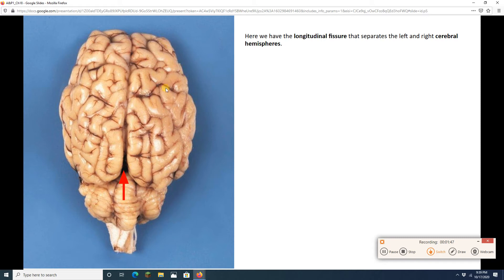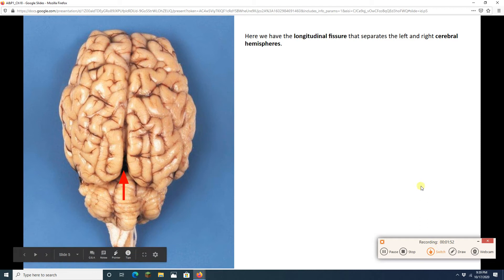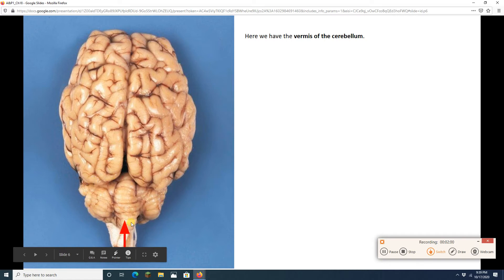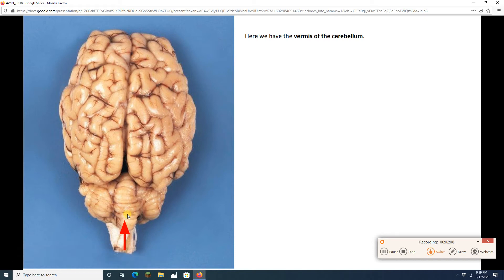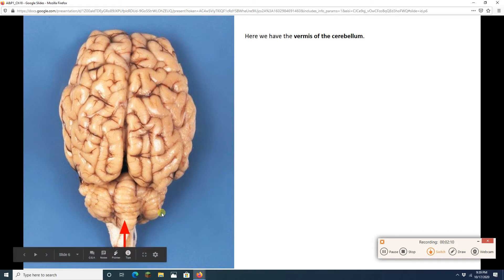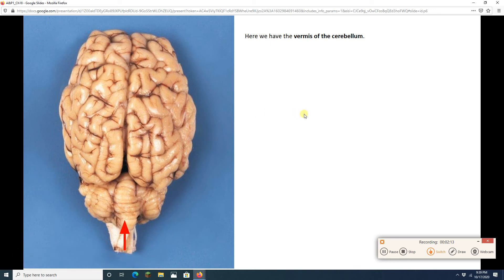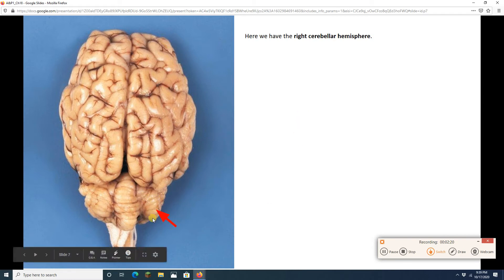The longitudinal fissure is separating my right and left cerebral hemispheres. Right back there, we've got the cerebellum — the whole cerebellum right here. Sheep have a really big vermis. The vermis in the human brain? Not that big. Here the vermis is really tall, close to the size of the cerebellar hemispheres. You can see the folia on the cerebellar hemisphere to give it more surface area.